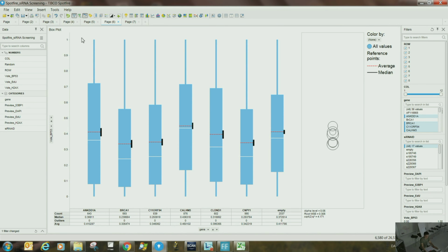So before that, you have to click on the tags. What I'm doing now is basically making artificial labels, which are not there in the data itself. I'm making a category from the user, by the user.